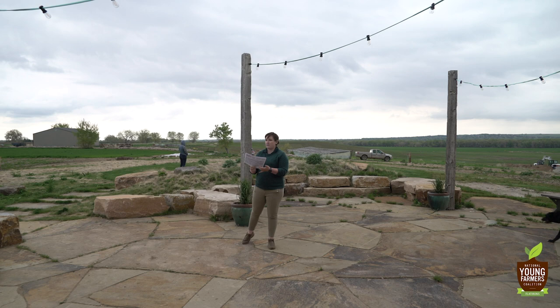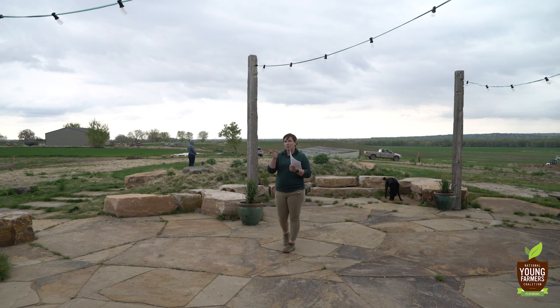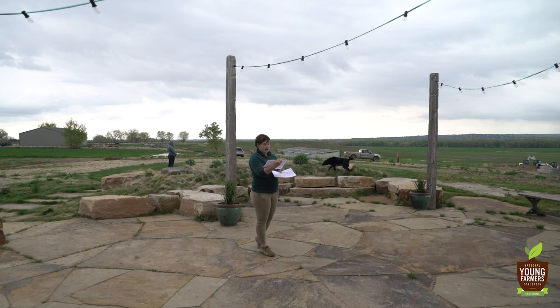There's three tests in here that all kind of give you three different soils, and they all are slightly different. So you can kind of look through there. It's a little brain experiment for yourself. I had fun comparing them and kind of practicing going through and saying, okay, what are the first things that I see on here that are going to give me pause, and the first things that you can address. So that first one, it looks pretty good. Like, I didn't look at this and say, oh, dang, you're in trouble. I looked at it and said, yeah, you're doing okay. You're a little low on nitrogen.